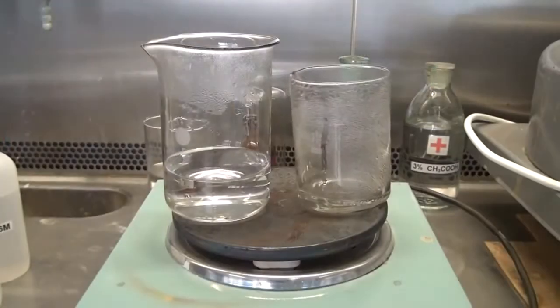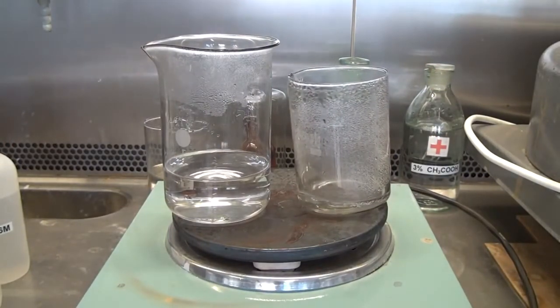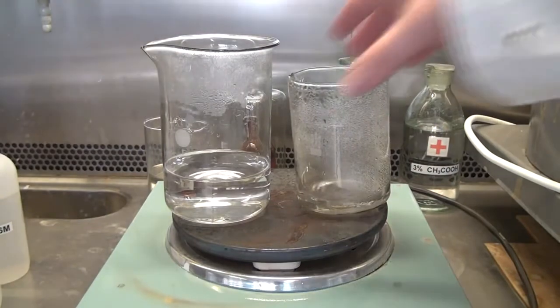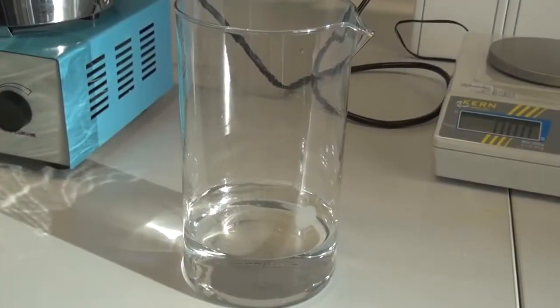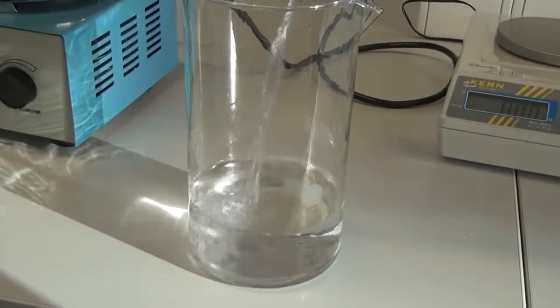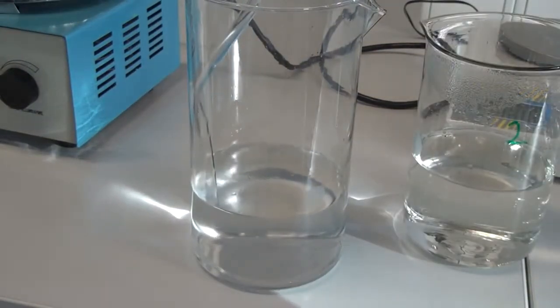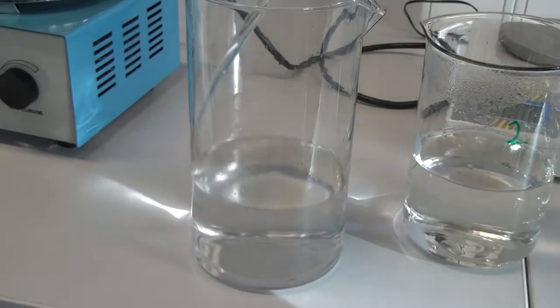Starch is not very soluble in water and in order to dissolve it well, we will need to heat the mixture for about 10 minutes. After the starch is dissolved and we have got a so-called starch paste, pour it into the glass with our third solution. Next, the solution volume is brought to one third of a liter.